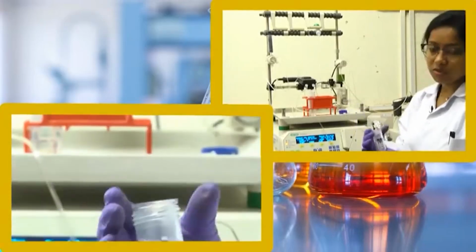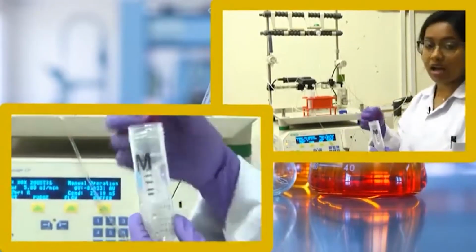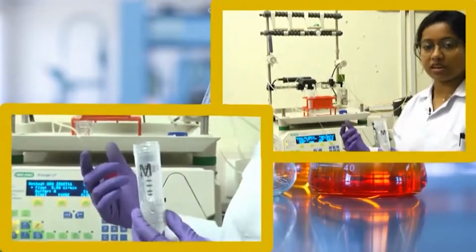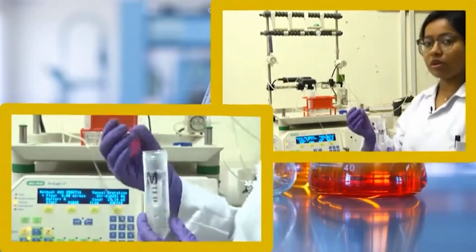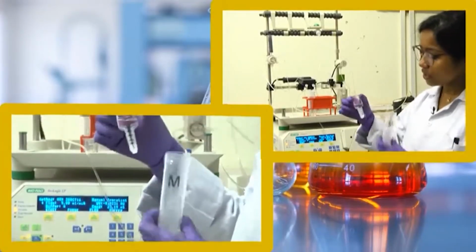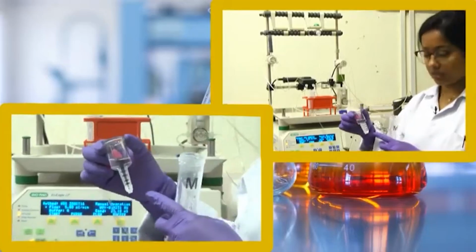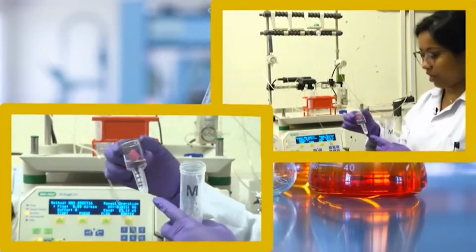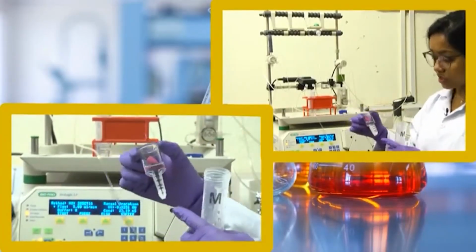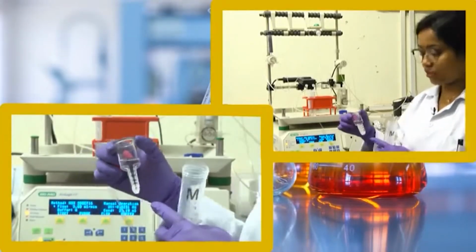If you are using, suppose, a 25 kilodalton protein or 50 kilodalton protein, then you can have a higher molecular weight cutoff, suppose a 10 kilodalton cutoff or so. Then anything below 10 kilodalton will come out from this particular holder. So you should use a cutoff which is lower than your protein's molecular weight. Suppose you have a 15 kilodalton protein, you should not use a cutoff of 12 or so.